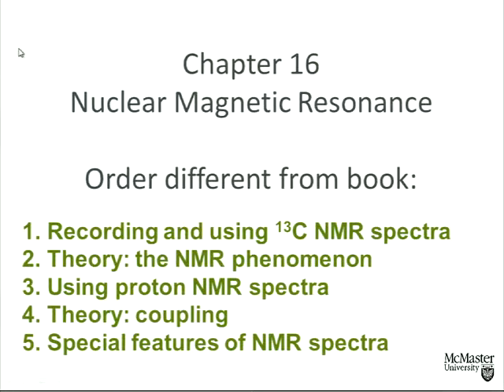And then we'll see that in proton NMR spectroscopy we get several different pieces of independent information, bits of information that we get, for example, from chemical shift that tell us about the environment of protons, information from recognizing that the technique is quantitative, so it tells us how many protons or hydrogen atoms we have in a particular site. 3 for a methyl group, for example. So we can actually count 1, 2, 3 hydrogens in an environment. They're all the same, ergo we must have a methyl group, for example.